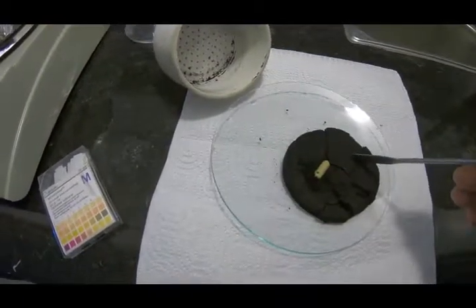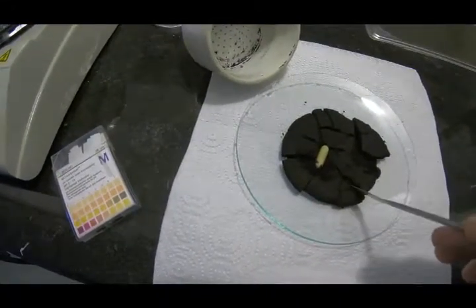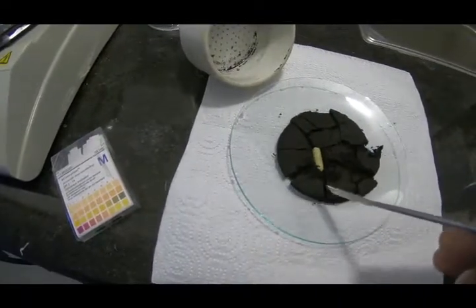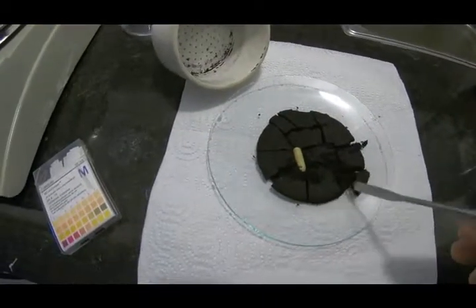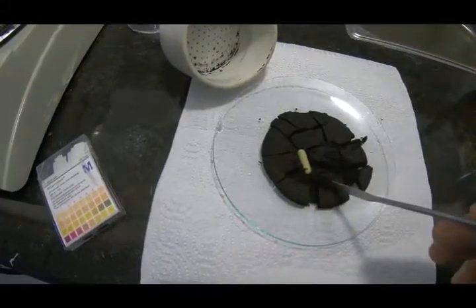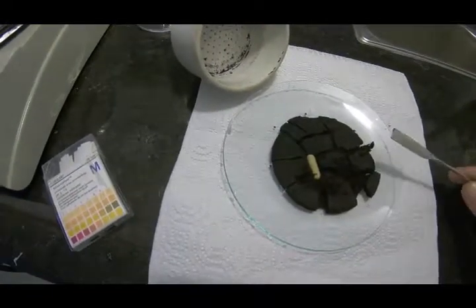Okay, I removed it from the funnel and put it in this plate so it can dry at room temperature. I repeat it once again, please don't dry this stuff by heating it. It may ignite very easily. If you just leave it a few hours or maybe a day at room temperature, it will dry. Then you can put it under vacuum and dry it all the way. Thank you.